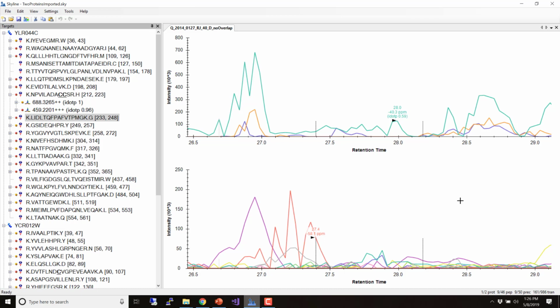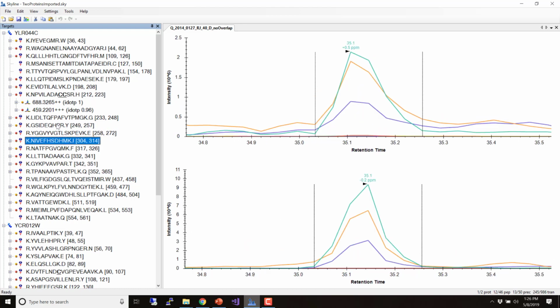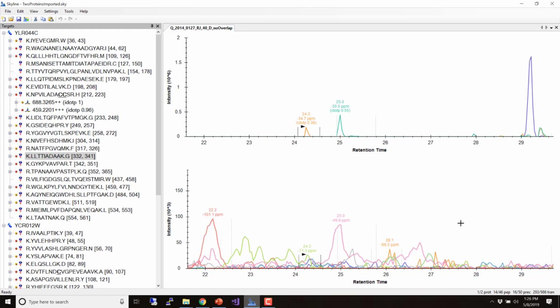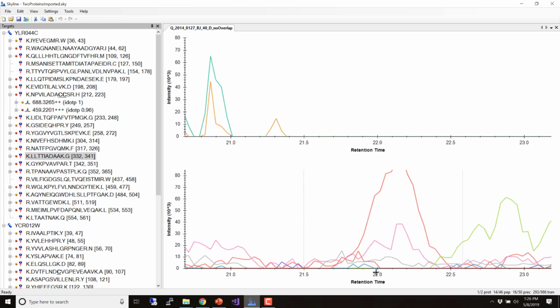You've got to really heftily, manually validate this stuff. If you look at it sort of naively like this, just enter in a bunch of peptides. If I look down, this one looks great. This one looks kind of sketchy. This one looks great, this one really terrible. If you were trying to figure this out naively, looking around this data set for where this peptide is, it would be really hard to say where it would be in my data set. Analyzing it naively from a peptide basis is pretty difficult.